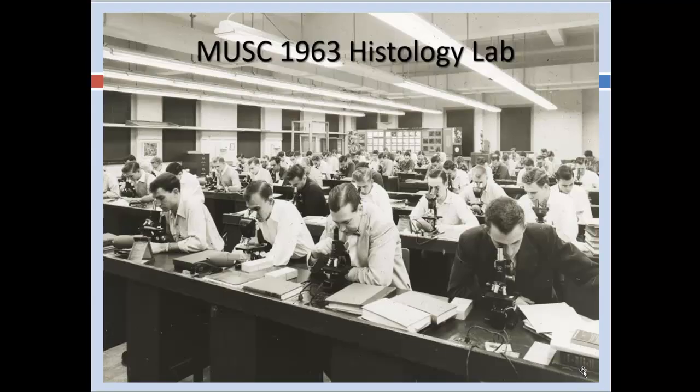And then this is the Medical University of South Carolina lab in 1963. And there you can see students peering through a single eyepiece and also two eyepieces. In other words, a monocular right beside a binocular. Now, this monocular microscope would be cheaper than this binocular.